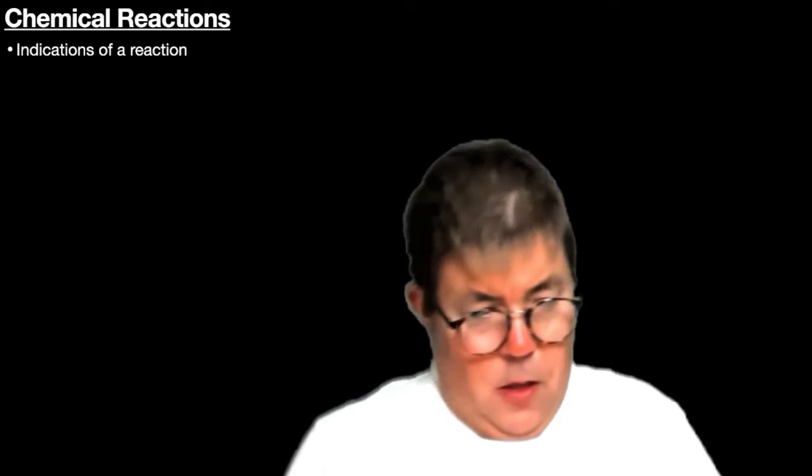Before I get into the procedure and more details about double displacement reactions, I want to review indications of a chemical reaction. I'm going to make a list of some things to look for to show that there is a chemical reaction occurring.